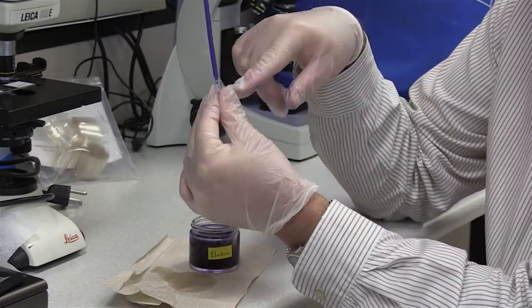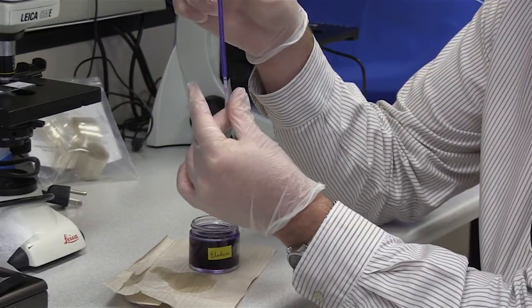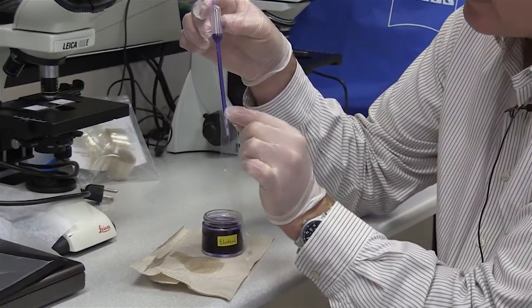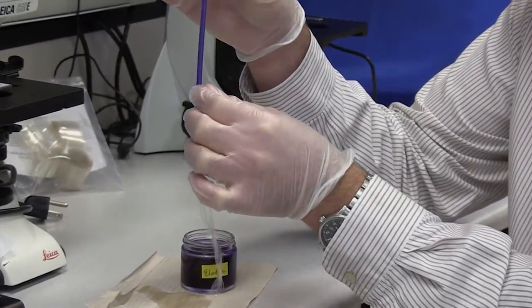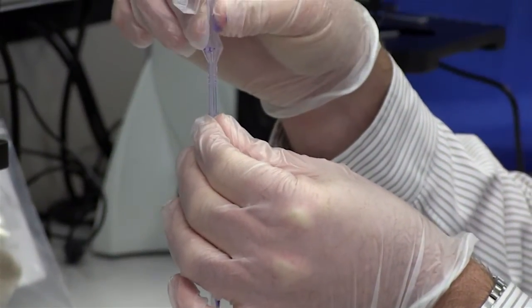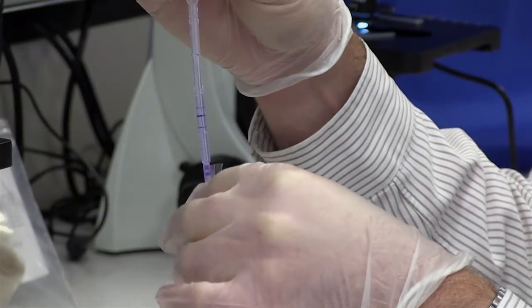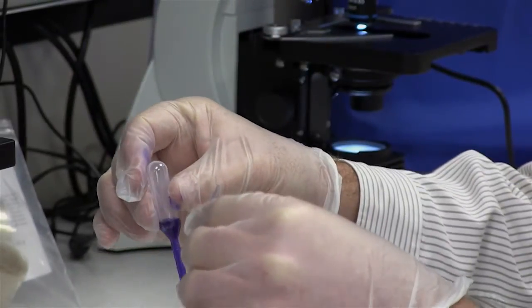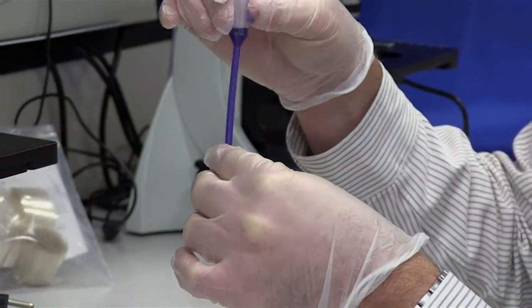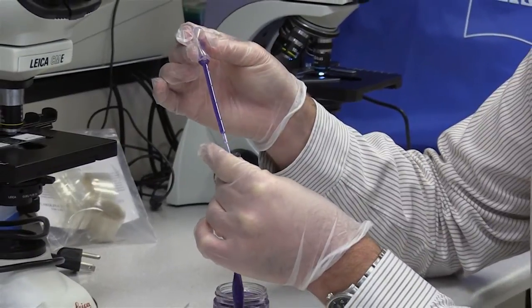So I have opened the end of the tube by rubbing the tubing back and forth between my fingers. And you may be able to see that I've inserted the tip of the dropper in the opening of the tubing. So I'm just going to use the dropper to add some of this purple water. You have to be careful because it wants to stick together. So I'm just going to keep adding some purple water until we get the tube about half full.